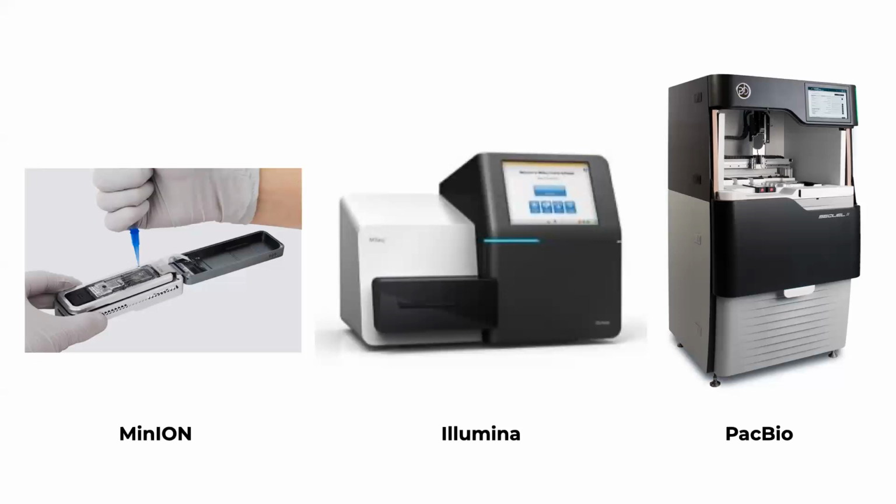However, their quality of read could be limited. So there are a lot of errors, a lot less reliability on each nucleotide that we get out of there. For Illumina, there are multiple approaches like paired-end sequencing that allow us to get high quality reads, but they're typically going to be shorter. And PacBio is the more expensive option, with much longer reads and higher quality than MinION.